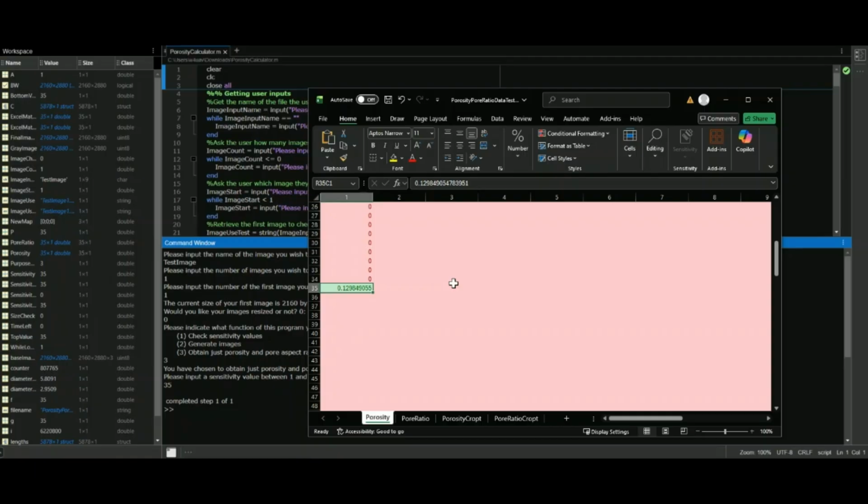So I use those values just as sort of a guide. I also use the images from their paper to guide my range, and I was able to implement something into Excel that will automatically label these red or green based on whether or not they're acceptable. So that's what the red and green means.